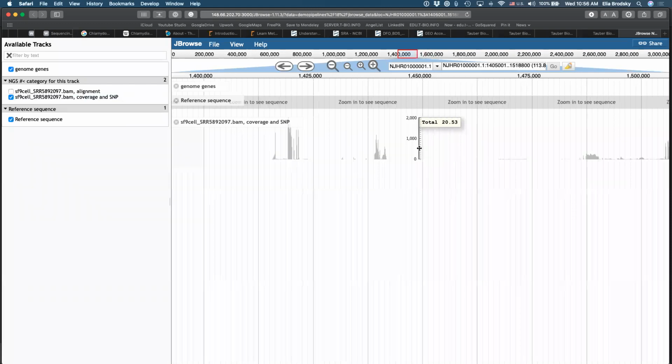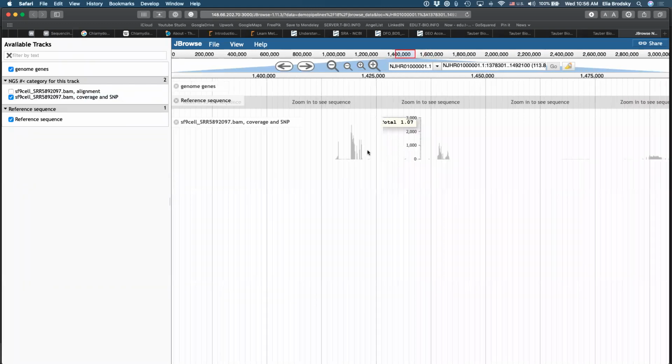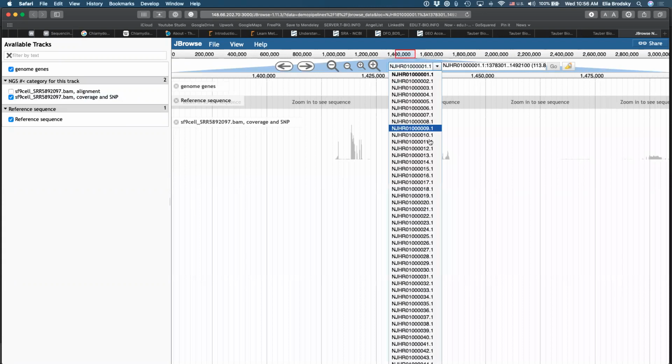Typically, when you look at this kind of an alignment, you also will have multiple portions to select from. So these could be chromosomes. Again, where did these separations come from? If you think of a FASTA file, they will have that reference written out there. If you have a human genome, for example, there will be chromosomes. If you have a database of several FASTA files combined together, for each one of them, you will see that right here.